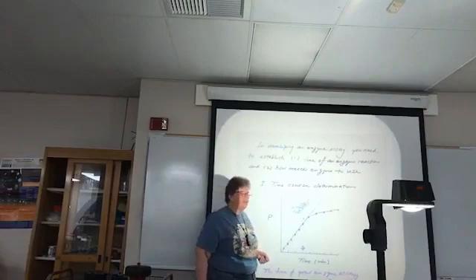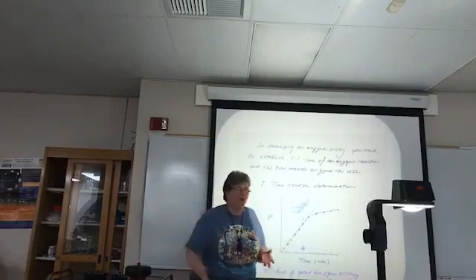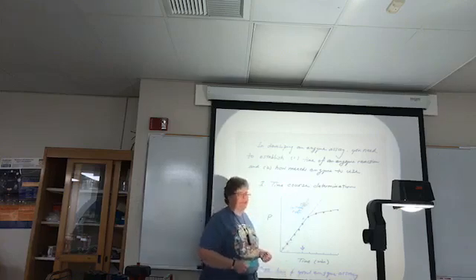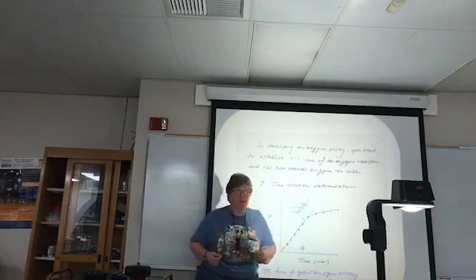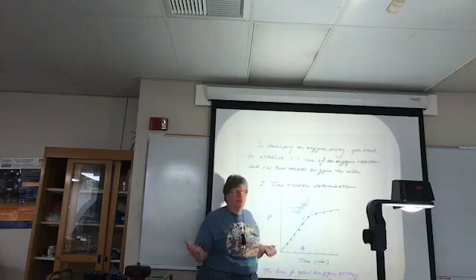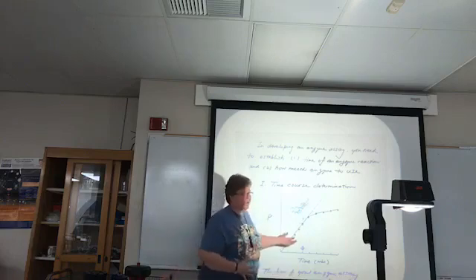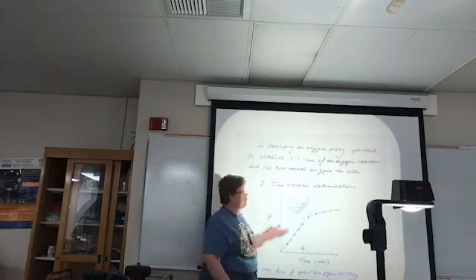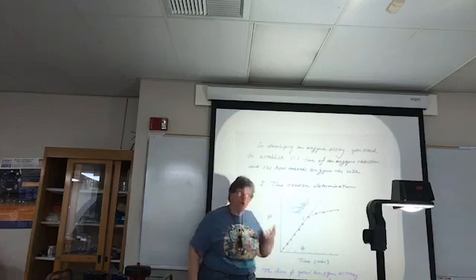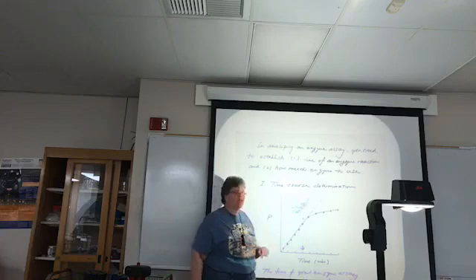You can have enzymatic reactions that take place over an hour, or you can have enzymatic reactions that take place in picoseconds. And for picoseconds, you have to have special equipment to be able to measure it. Enzymatic reactions that take place in an hour are too long for purposes of this lab, which is why we've chosen a nice measurable reaction with a reasonable time course for this particular experiment. But you have to say, what amount of time do I need?